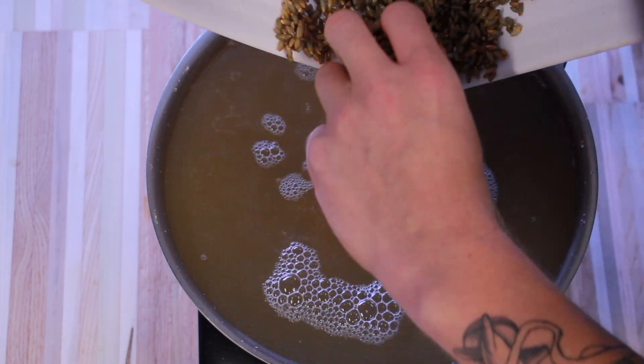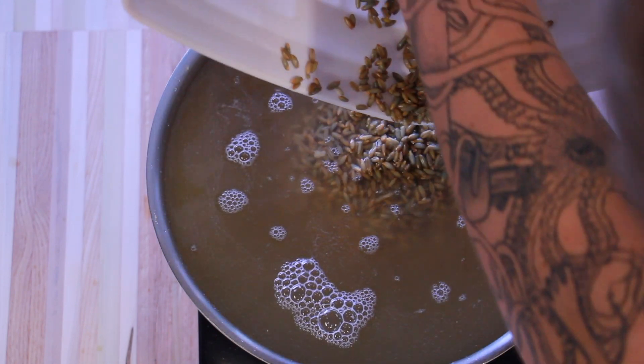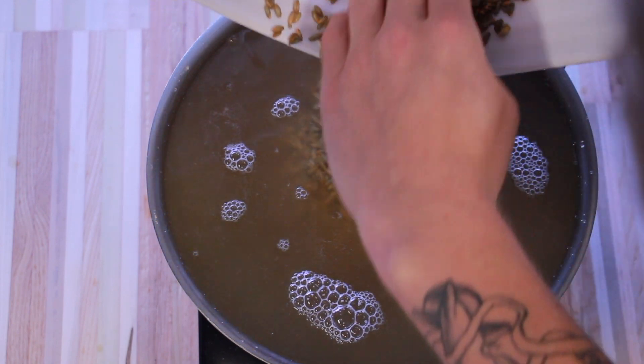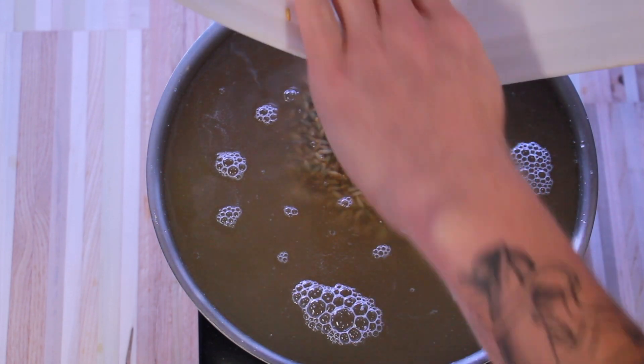Pour all of your rye grain and water mix into a pot that you can boil in. No need to change out the water here — in fact, you want to keep the same water that you soaked it in so that the gypsum powder stays with your grains.